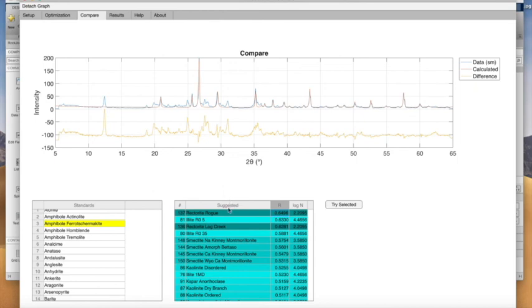And now we're hitting something that's a little more complicated. The first one that comes up is rectorite. So there's a couple rectorite in these top hits here. And then a couple illites. And then there's several smectites. Okay, so here's the problem.